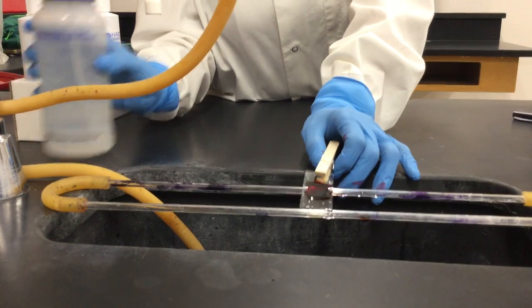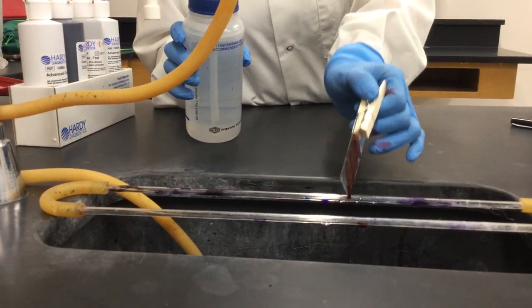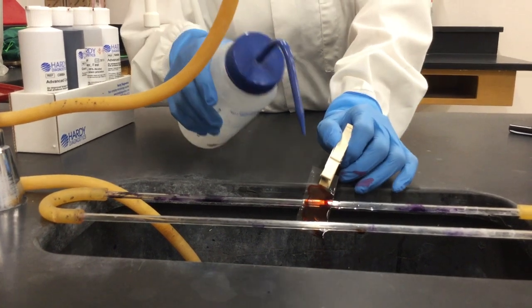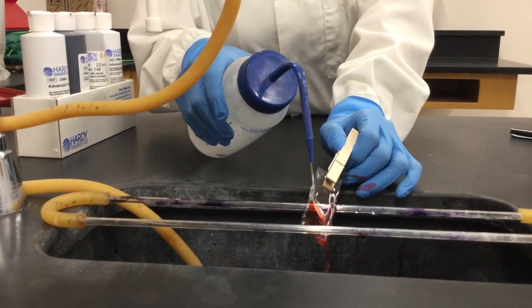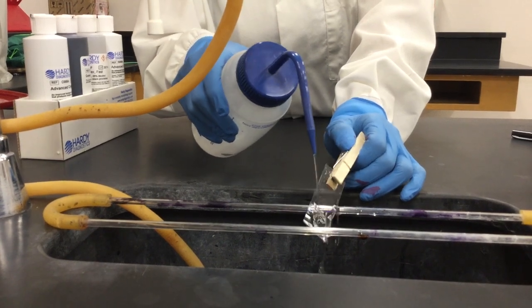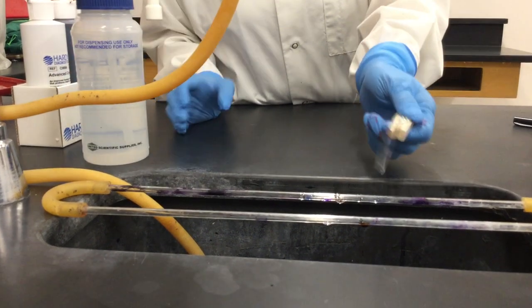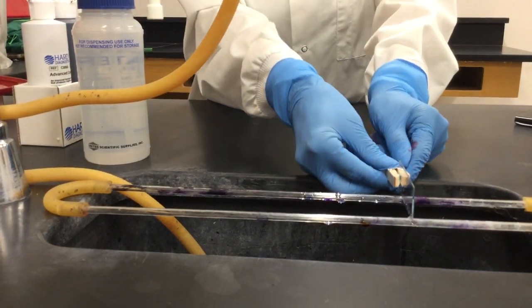Just a minute has gone by. And see how before I add water, I just get rid of the excess of stain, and then go in at an angle like this, and you will let it air dry like this.